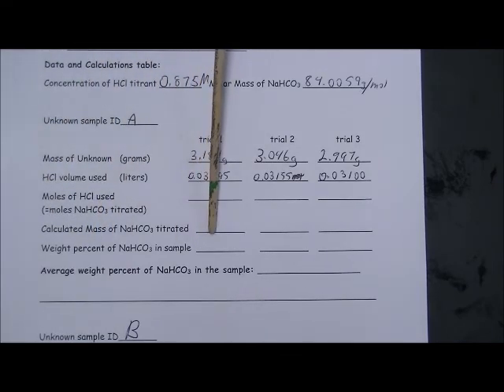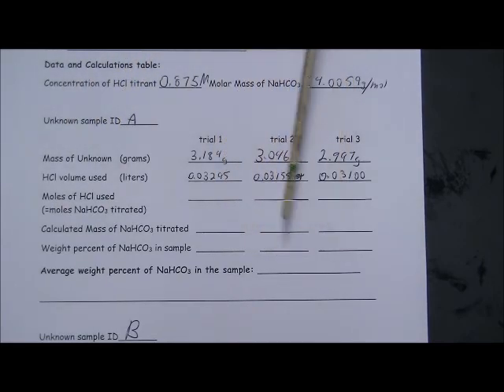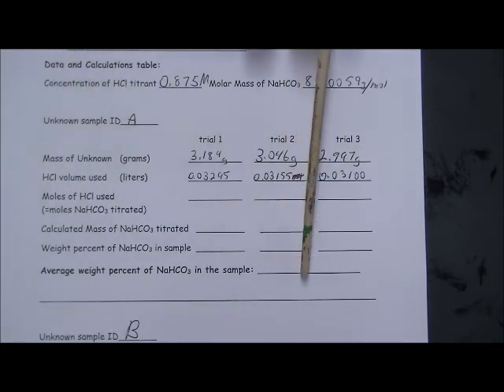and then times 100% gives you your weight percent of sodium bicarbonate. So this number, divide it by this number, times 100, gives you your weight percent. Once you have these three numbers, add them together, divide the total by three, and you have your average weight percent of sodium bicarbonate.